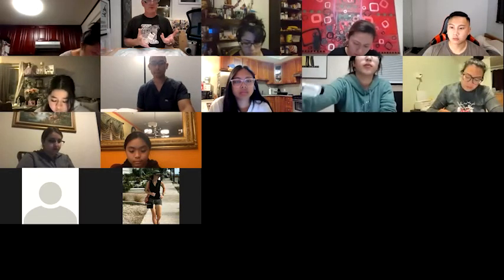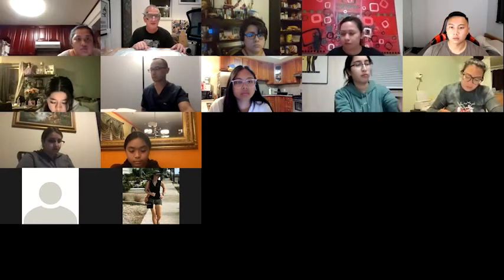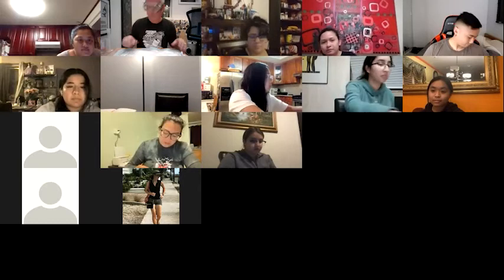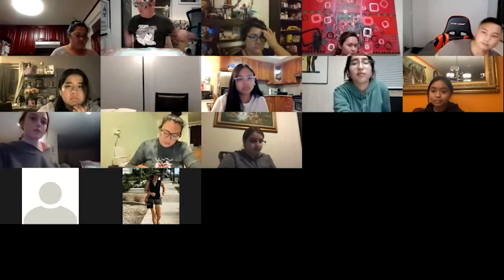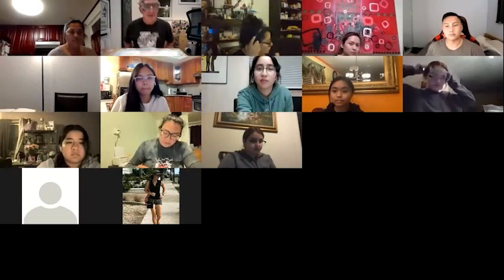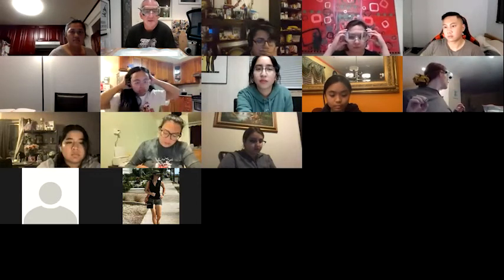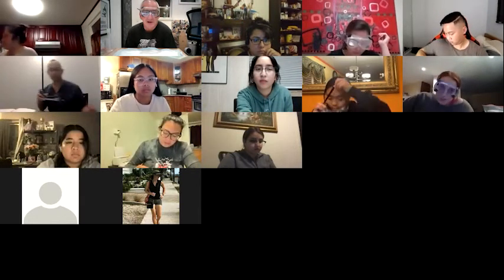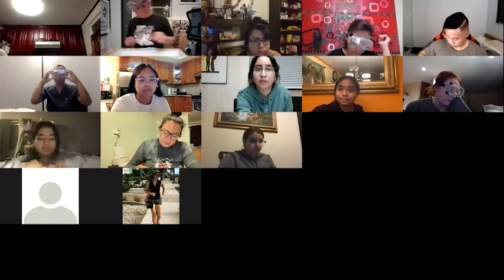So I figured what I'd probably do is just, everyone should have their cameras on and their goggles. And you're saying to yourself, hey, I'm going to look like a dork if I wear my goggles. And yes, you are. But everyone's going to look like a dork, so you shouldn't feel bad. I realize you may not think it's important to wear goggles for dealing with sugar and water. I understand. But later, when we're dealing with acids and bases and fire, it's non-negotiable. So get used to wearing them.